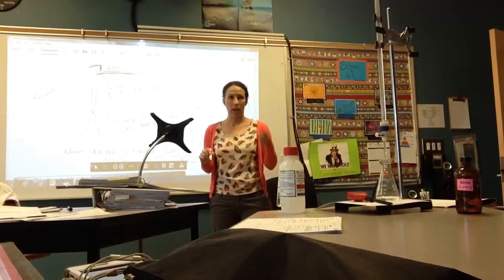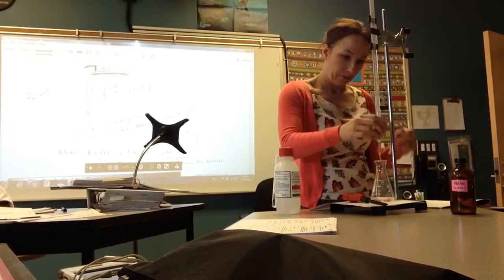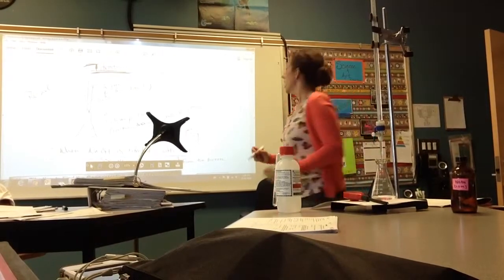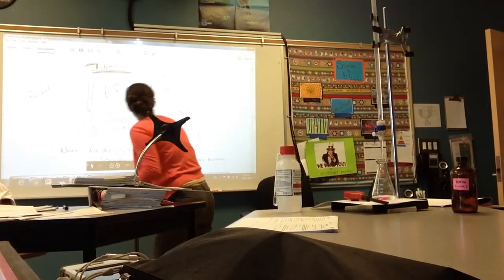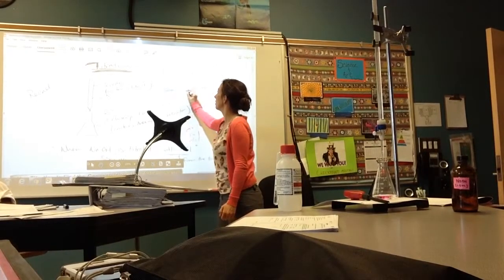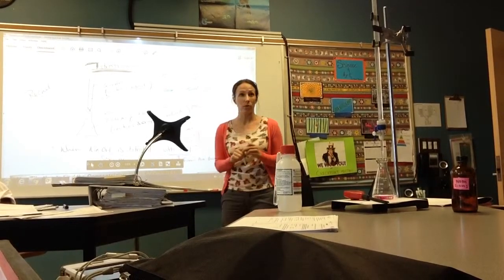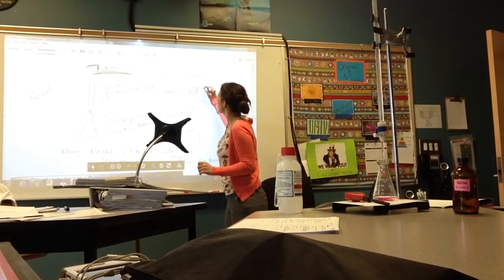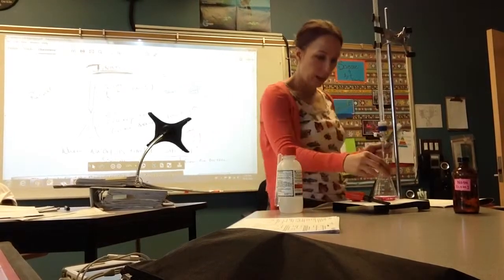Did you get that? I'm going to add 1 drop. Let's see if I can get it to happen. Come on, you guys. Maybe not. I'll just let it keep dripping. Eventually, within that 1 drop, I am going to add that 1 drop. It's going to go from excess HCl to completely neutral, 10 moles and 10 moles, and excess 10.1, let's say, NaOH.